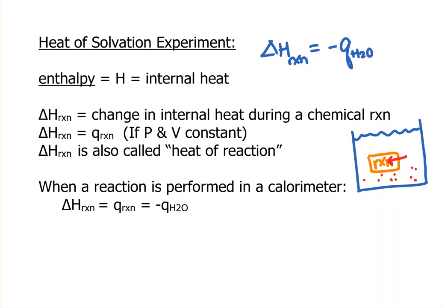If this is endothermic, we're going to expect that the solution will cool as the reaction of dissolving takes up heat. Okay, so enthalpy, it's internal heat. It's stored in a chemical or potential energy form. It's not necessarily hot, but remember, enthalpy has to do with the substances and not the surroundings or what's happening with the water cooling.